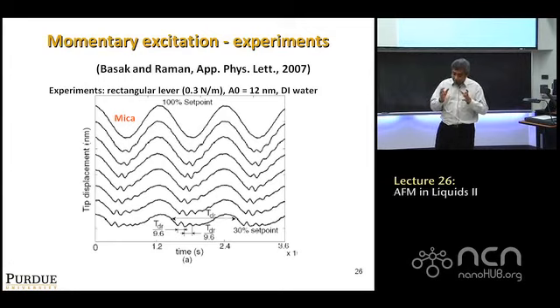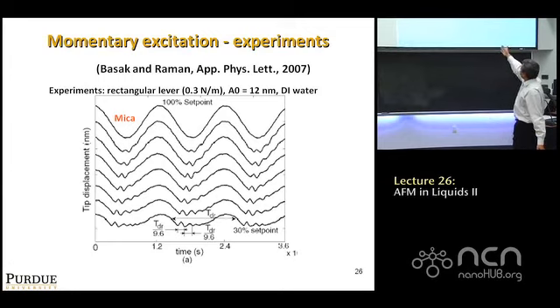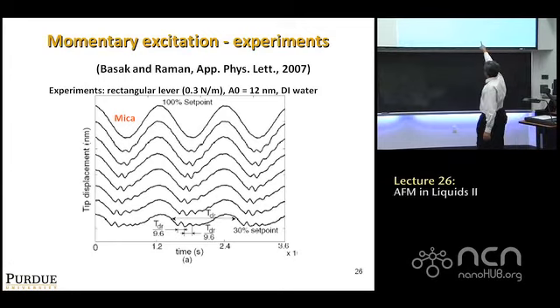So if I bounce it here, or if I bounce it, you get different sounds. So if you can map the amount of this ringing of these internal degrees of freedom, that's another way to map local properties. So that's what one can try to do. This is a pretty specialized technique, but the idea is you're trying to capture these little ringing effects, or if you go back to Putman's paper, the distortions that he got at the bottom of the swing. You're trying to capture the magnitude of that as you go over a sample.